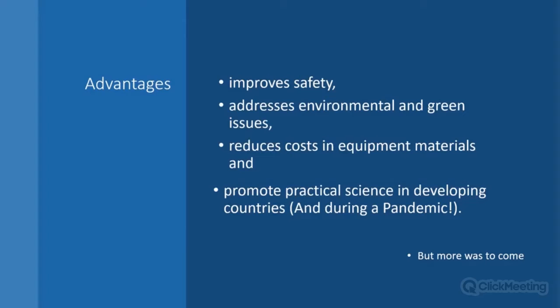We address any sorts of issues that appear, such as when the whoosh bottles first came out, we wrote a very precise method of doing it, and woe betide you if you don't follow it and something goes wrong. It also, as Adrian pointed out, has green credentials and reduces the costs of equipment, materials and disposal.